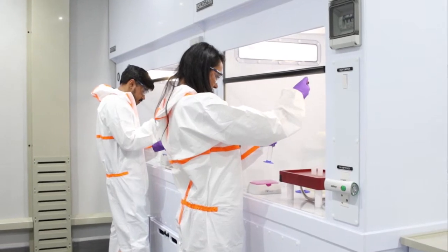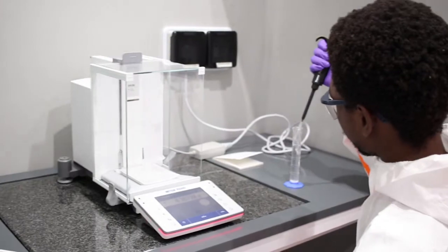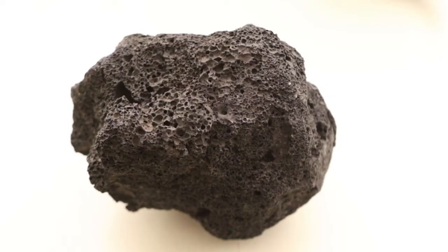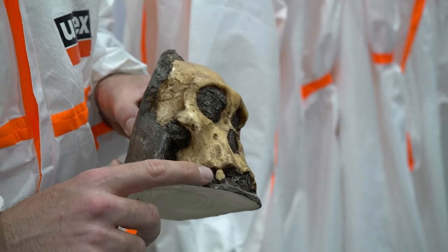So the WITS Isotope Geoscience Laboratory is designed and planned to separate elements of interest from earth materials like rocks, fossils, meteorites, and ground water.